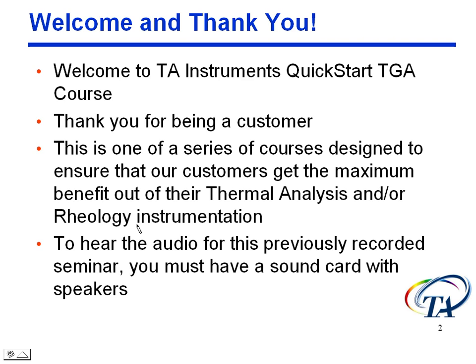This is one of a series of courses designed to ensure that you, our customers, get the maximum benefit out of your thermal analysis and or rheology instrumentation. We have courses for a wide variety of instruments, DSC, TGA, DMA, rheometers, plus some on the software, and more courses are being added all the time, so be sure to check our website for that.